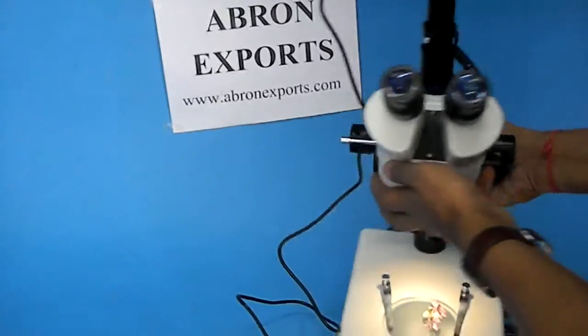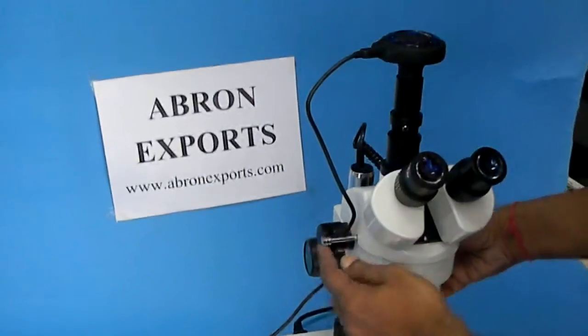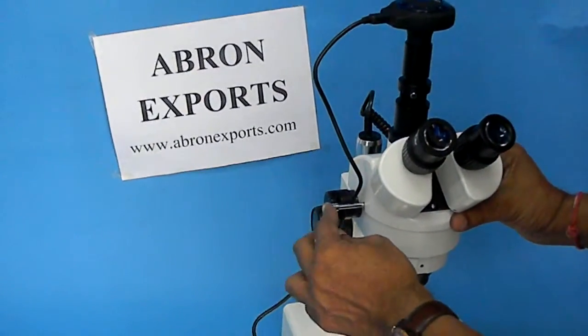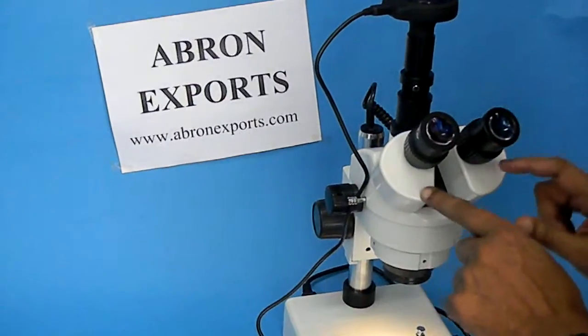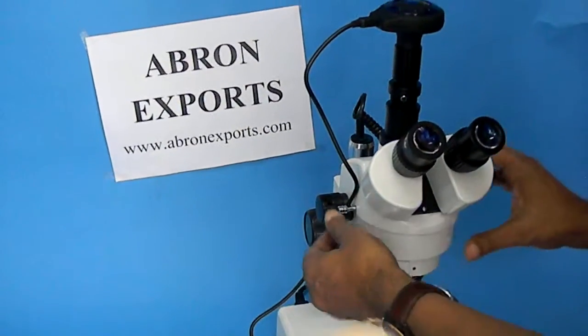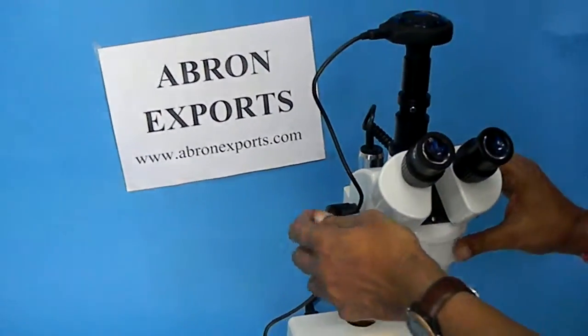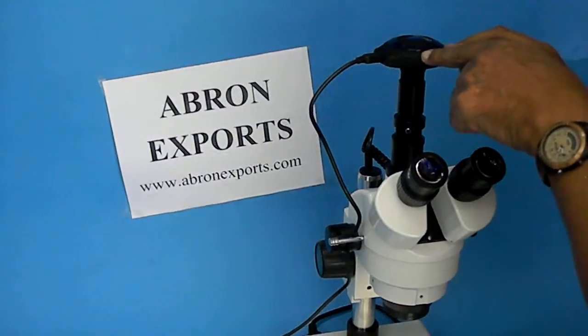When you have to use the camera, this has to be pulled out. Otherwise you push it in to view through the eyepiece. Pull out and then this camera works.